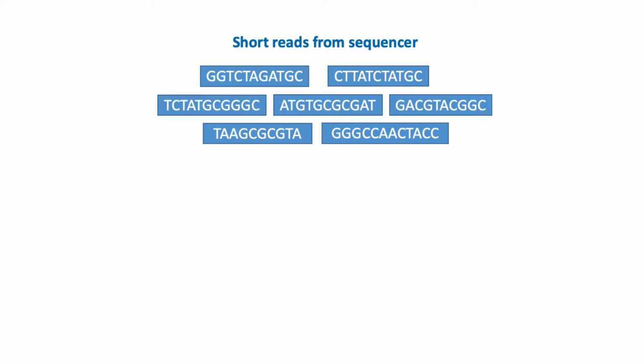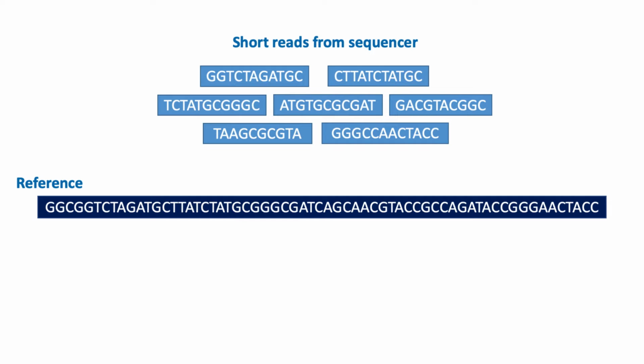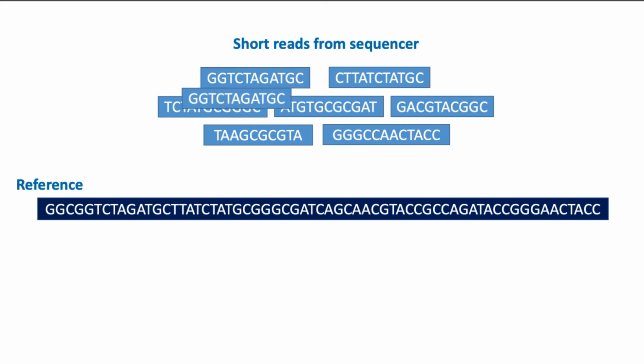Sequencing machines produce a collection of reads from the sample RNA library. The reads are just sequences of nucleotides that need to be mapped to some reference sequence to get useful information like gene expression levels. The task of assigning the reads to a specific location in the reference is called read alignment or read mapping. This task is not trivial.